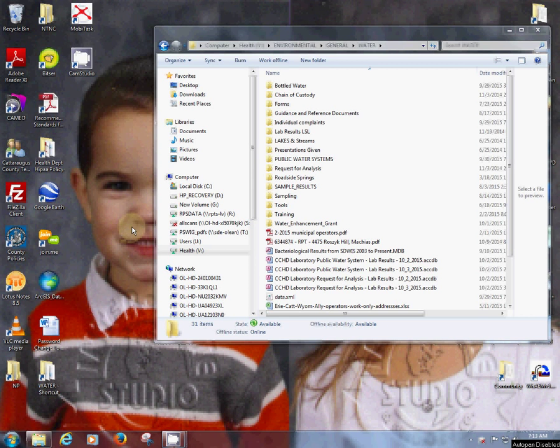Good morning and welcome to video 4 of the Cattaraugus County Health Department Laboratory Information System Training videos. This video is going to focus on the querying of the databases that are created.